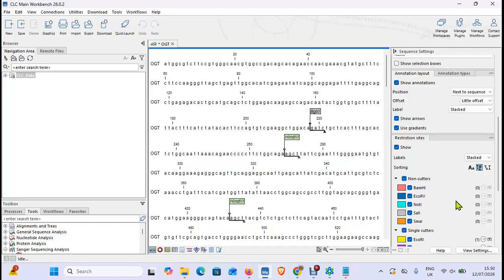And I know that some of the audience will already be groaning in advance when I say I follow the rule where GC counts as 4 temperature points and AT equals 2. Yes, it is a little bit of a back-of-the-envelope calculation, but it has served me well. And there are those who would say, oh, you have to analyze the hairpins, you have to look out for the GC content. No, I make a point of reaching a temperature threshold depending on the template I use.